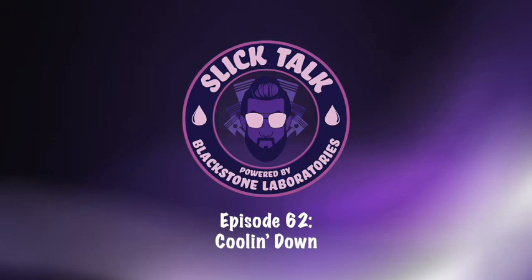Well, that's a worthwhile question, given that I'm betting most of our listeners don't assume that we would analyze coolant. Most of what we're doing at the lab is analyzing petroleum-based substances, and in a perfect world, petroleum is never going to come into contact with coolant. However, there are other characteristics, other properties of coolant that you want to analyze in order to determine whether or not it should be in use.